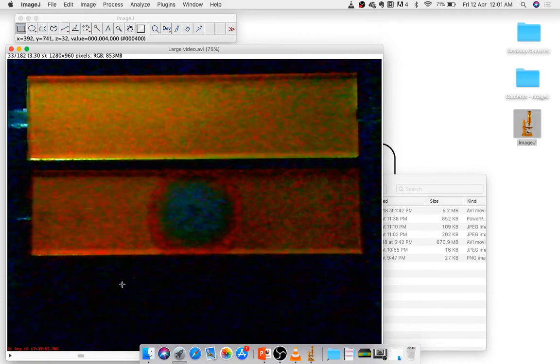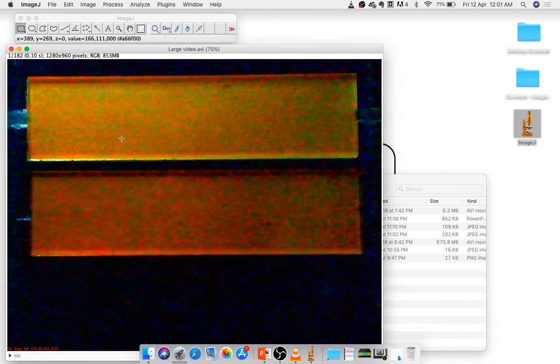And so this is obviously a video that at this stage you wouldn't want to put in the presentation. It's also 670 MB. So several things can be done with this. First thing is I want to crop this. I want to crop it so that I don't see any of the other background, and would only see this device.